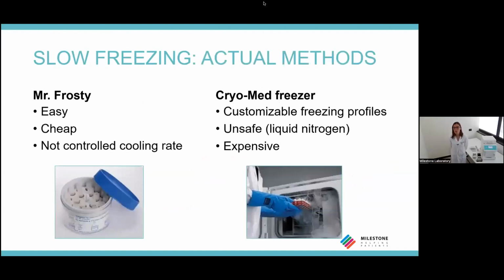I think that you already know this method. Anyway, its main features are that it is easy to do, it requires low cryoprotectant concentration, and it has no risk of contamination because samples are frozen inside sterile vials.